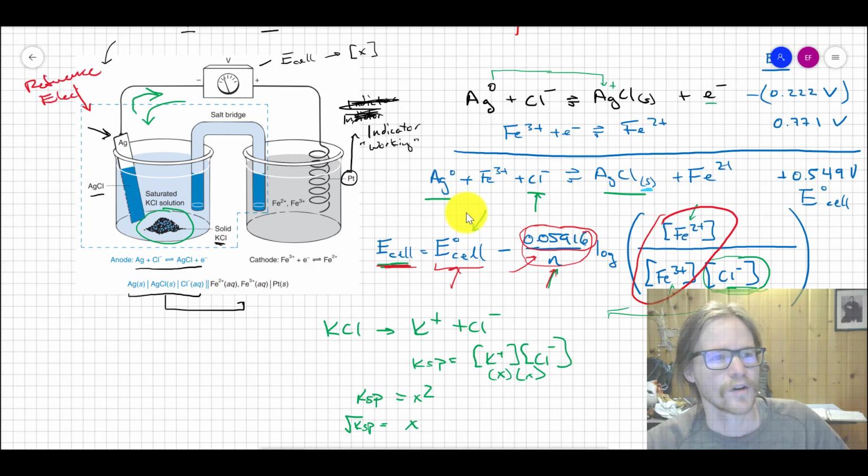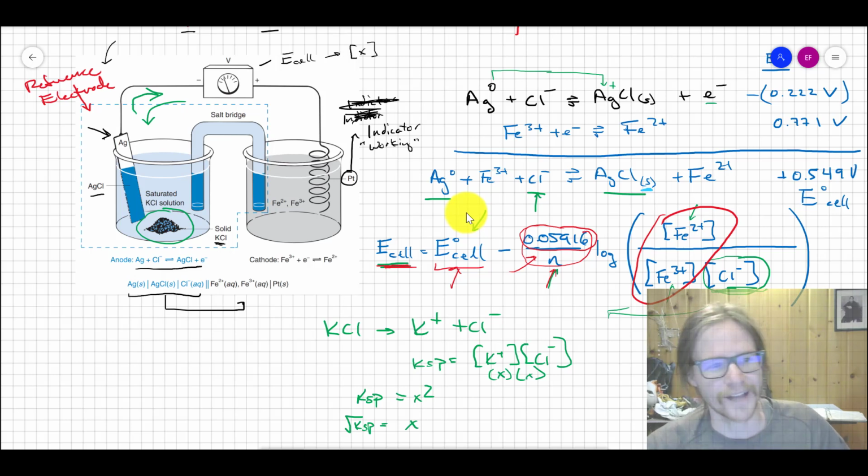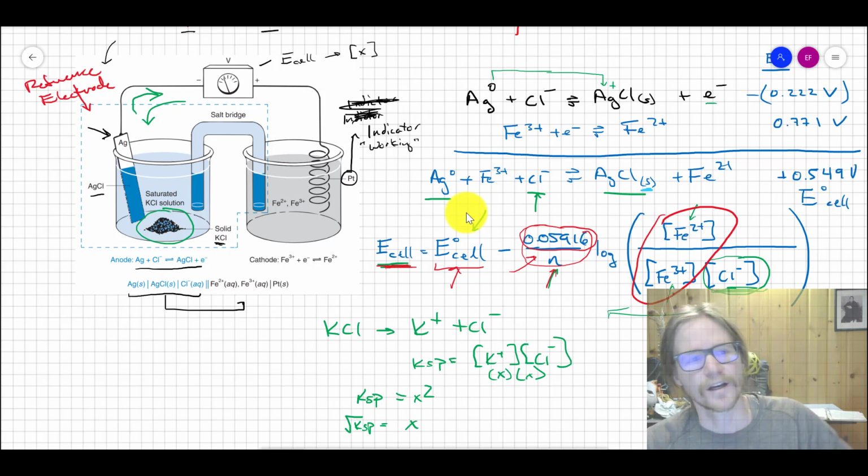And so what that means is often when you're doing a potentiometric measurement, we just construct that as a whole cell by itself, freestanding. It's really a half cell, but it's got a silver wire in it, it's coated with silver chloride, and it's saturated with KCl and water, and then it has a salt bridge attached to it. And we take that whole thing and we build it into its own freestanding electrode. Why?